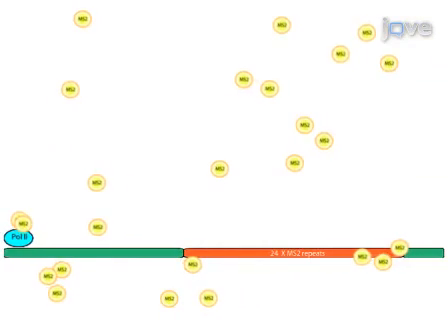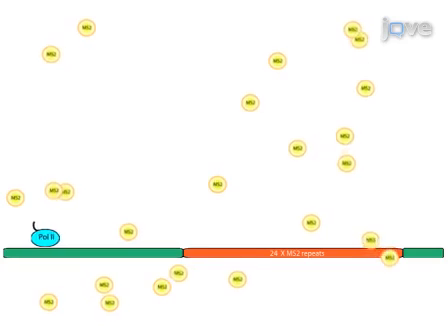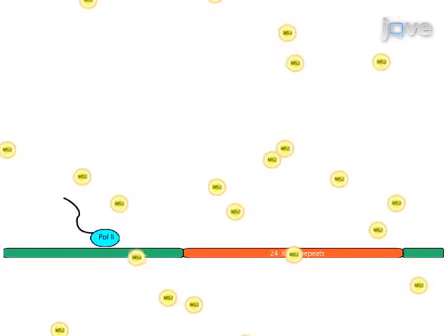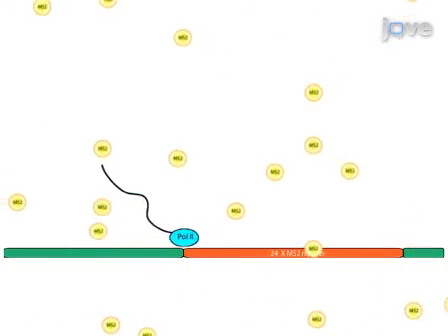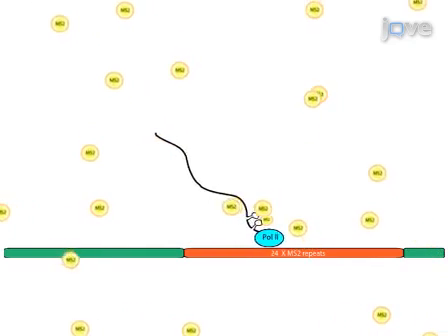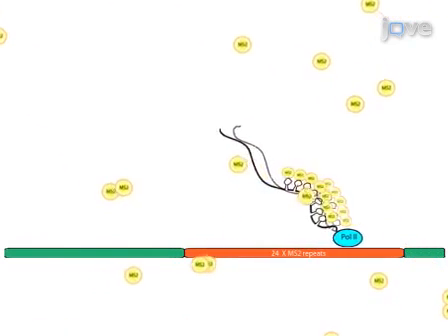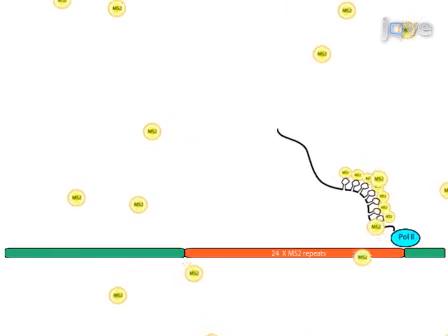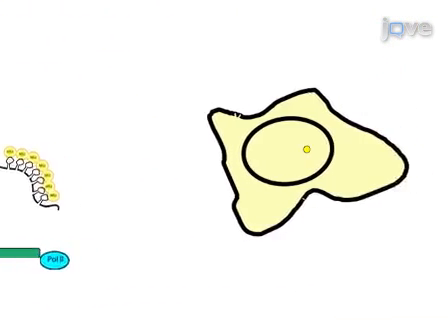When gene expression is activated, RNA polymerase II is recruited to the gene and moves downstream along the DNA strand, generating the mRNA molecule. In order to tag and detect the transcribed mRNA, a series of unique sequences, or MS2 repeats, that serve as binding sites for a fluorescent protein, YFP-MS2, have been fused into the gene sequence. The rate at which the MS2 stem loops are formed corresponds to the rate of transcription.